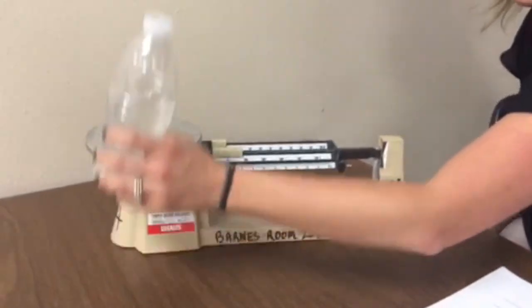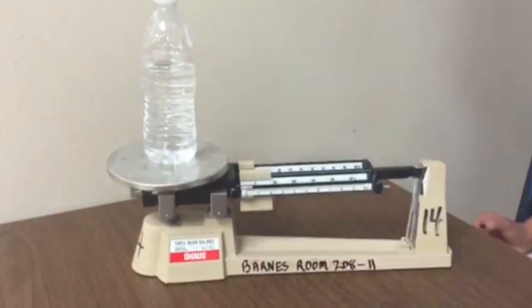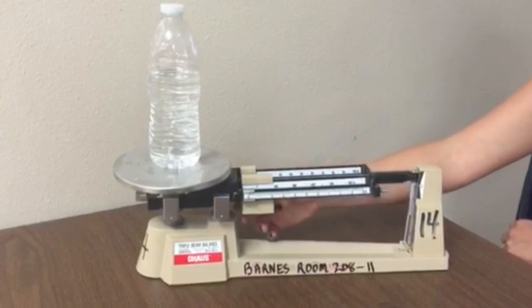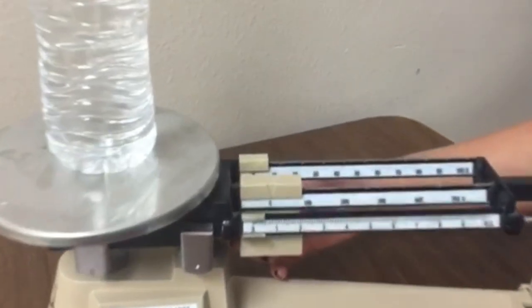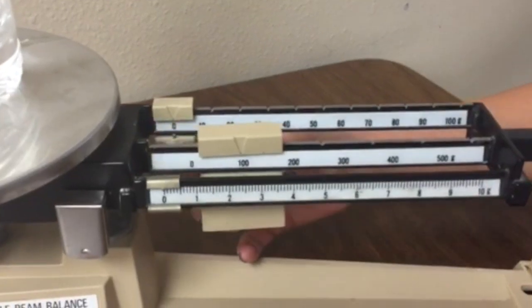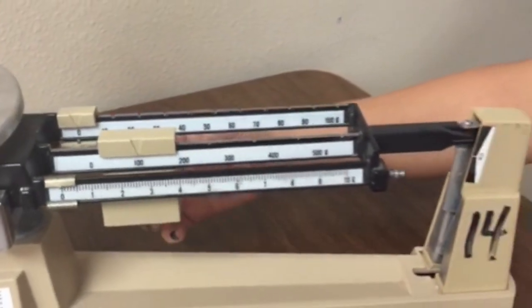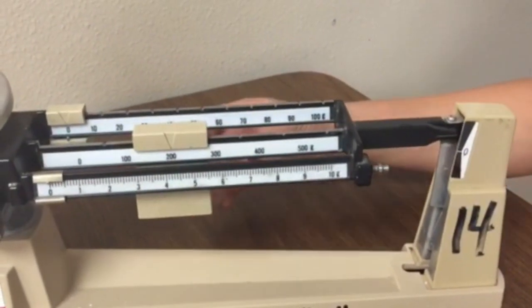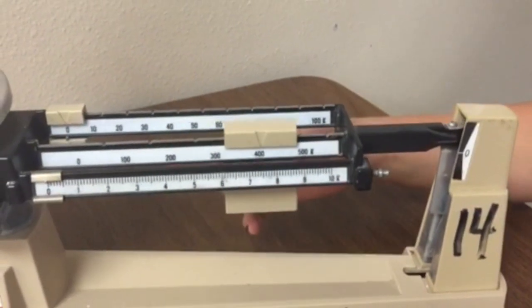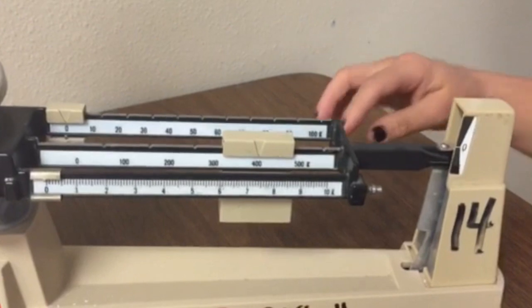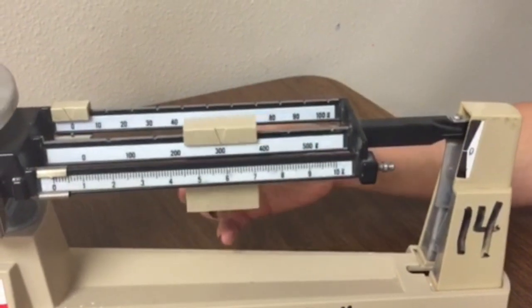We're going to measure this water bottle. When you're measuring, you need to make sure that you start with the hundreds, the largest one. It's in the middle and it still hasn't gone down. That means it's too much, so I'm going to go back to 300.